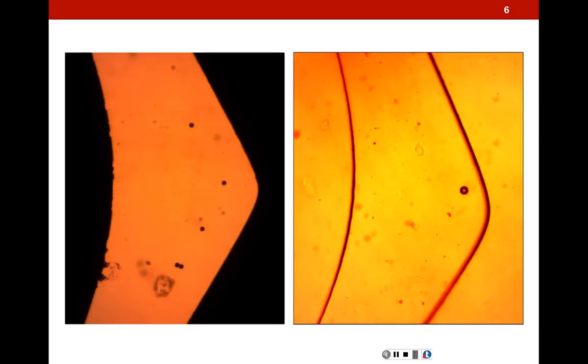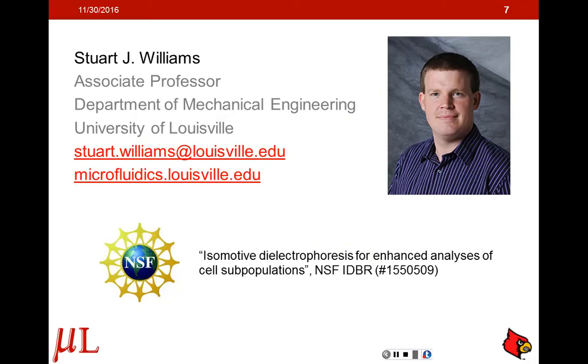So we can analyze tens to hundreds to thousands of cells within one setting and then identify small dielectric responses and differences between them.